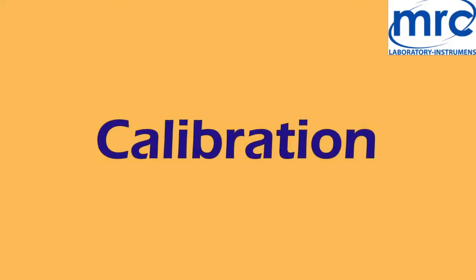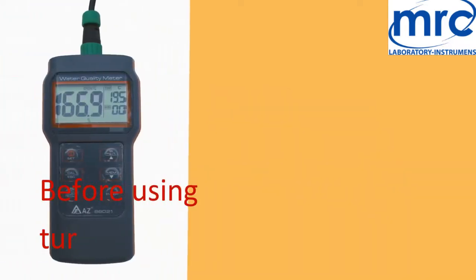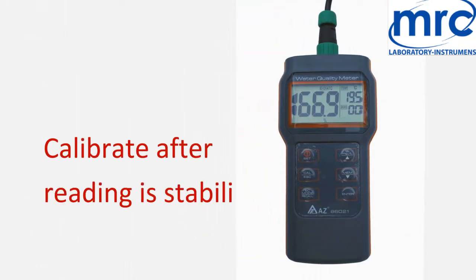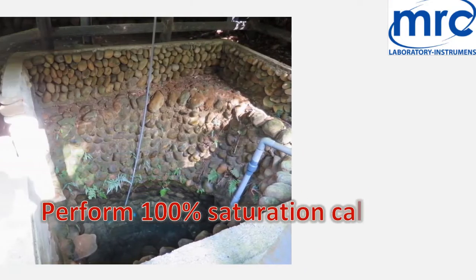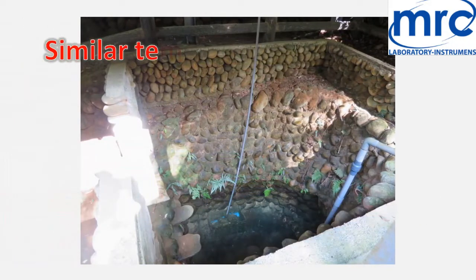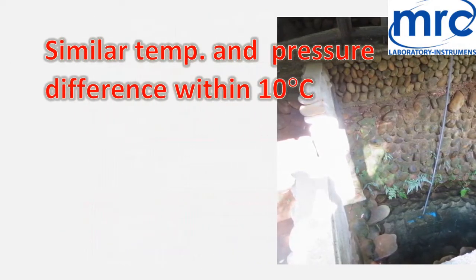Calibration — Dissolved Oxygen: Turn on the meter for 5 to 10 minutes and calibrate after the reading is stabilized. Before each operation, you need to do a 100% saturation calibration at the testing location, or in a similar temperature and pressure environment. Temperature difference should be within 10 degrees Celsius.